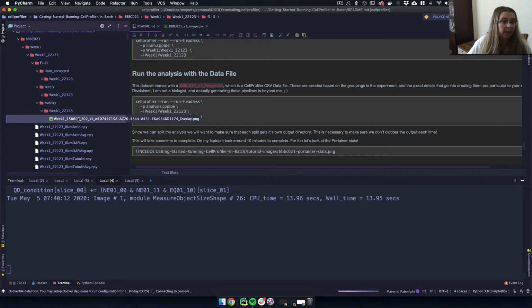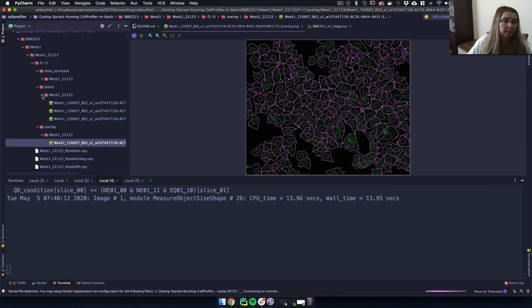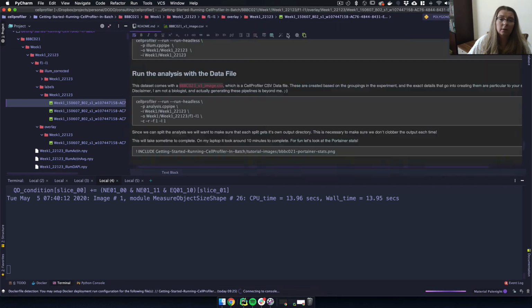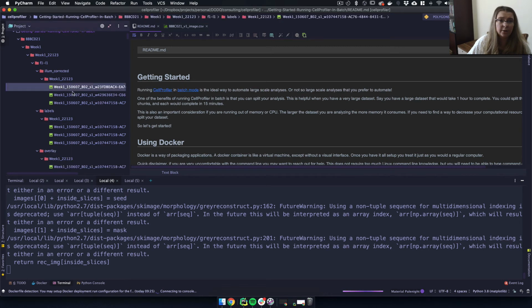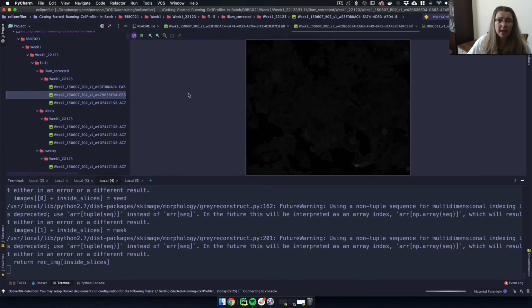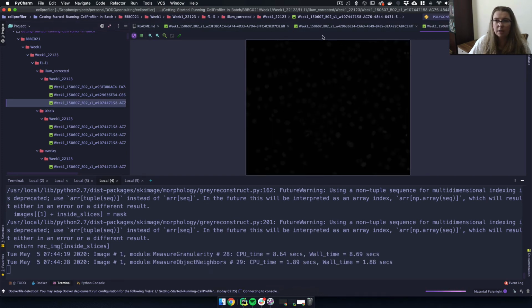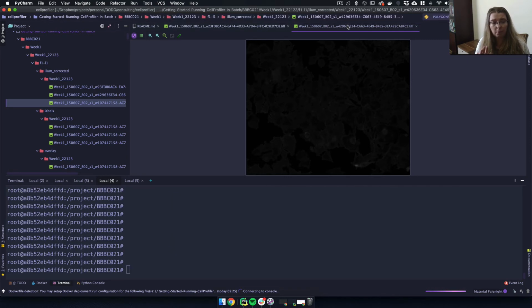We might. Okay, so you can see we are actually already getting some output. These are the very dark cell images. This is illumination corrected. So you can see actually for the illumination corrected, you can see a little bit more. If I'm going to do human readable images, I actually use a program called ImageMagick for that.